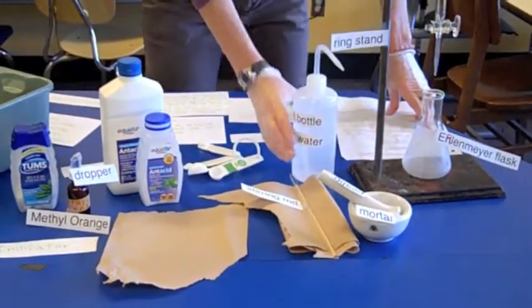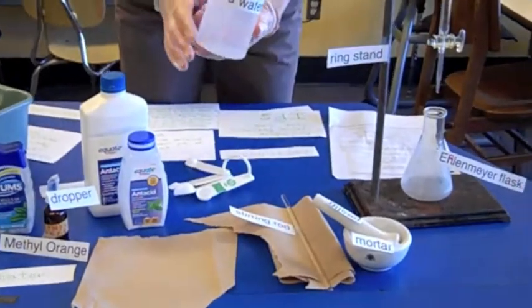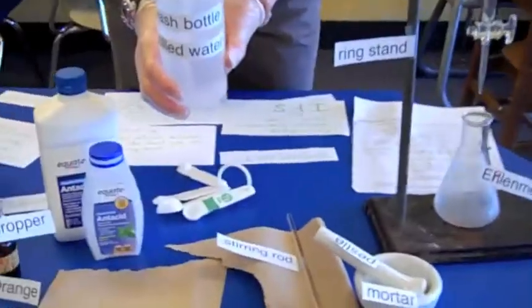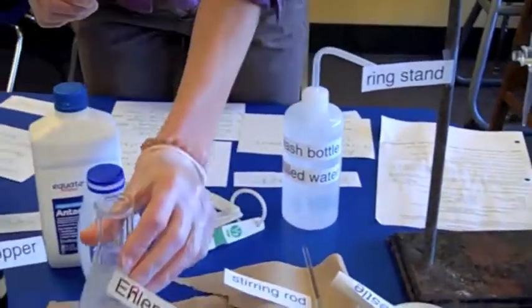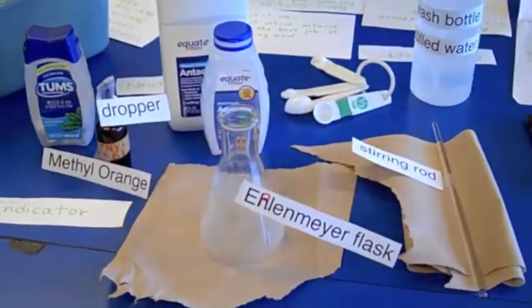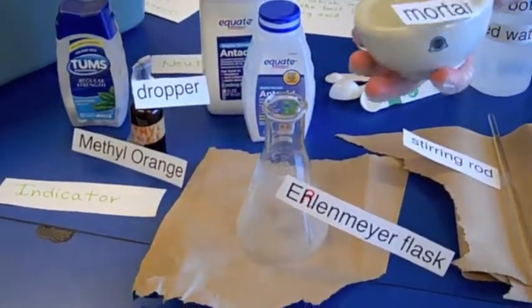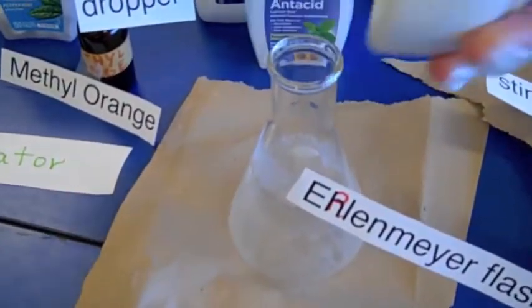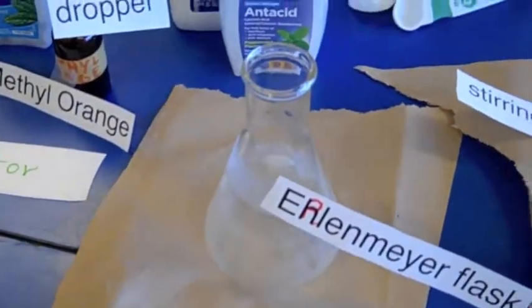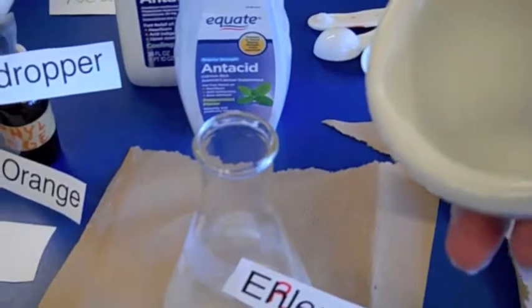Step 4 is rinse the mortar and pestle 3 times with distilled water. Wait, before you do that, did you add the powder to your Erlenmeyer flask? I forgot to tell you about that. Thank you. Get my Erlenmeyer flask out, preferably on a piece of paper towel to catch what misses. Then I'm going to take the powder and carefully dump it into the Erlenmeyer flask. Is there a little lip on that? There is. There's a little lip right there which will make pouring a little bit easier.